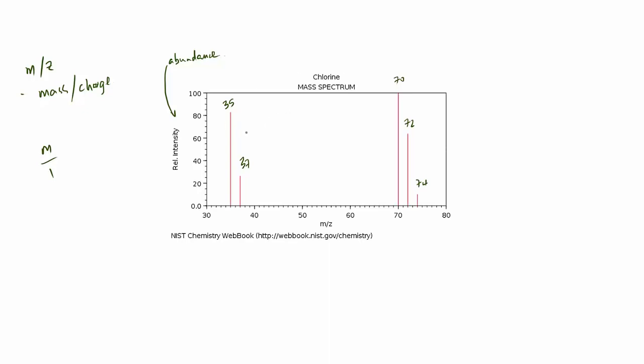Right, so this is a few bits about chlorine here. It's quite an interesting spectrum. It has loads of information in it. We've got 1, 2, 3, 4, 5 peaks detected on our spectrum, which means 5 separate things have hit our detector, at these relative masses: 35, 37, 70, 72 and 74. Now, these first ones are isotopes of chlorine atoms. This one here is the chlorine-35 atom, and this one here is the chlorine-37 atom, shown by these 2 distinct peaks, one at 35 and one at 37.